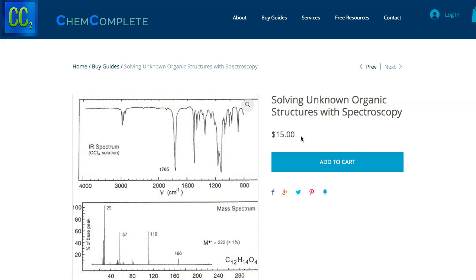We will go ahead and get started with our final part of the unknown spectroscopy lecture, where we are going to be solving a problem.